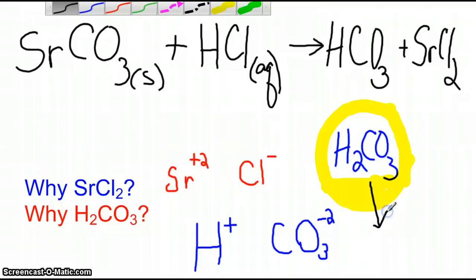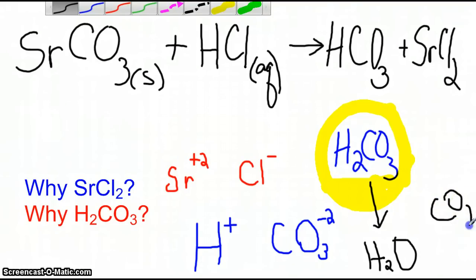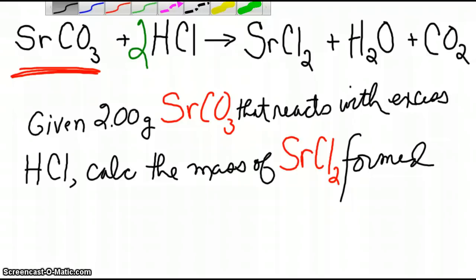As soon as you add the acid to the carbonate, you'll see the bubbles forming, and you'll produce your H2O and the carbon dioxide gas when they decompose. So, just review a few things.